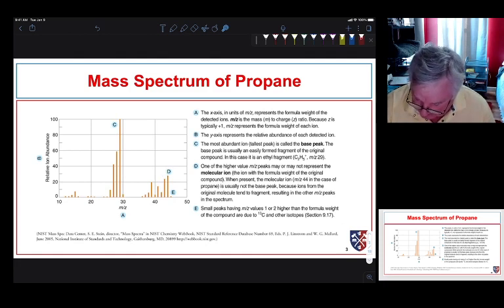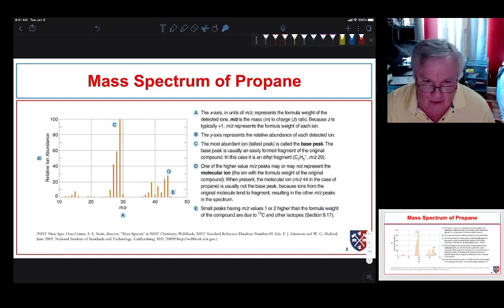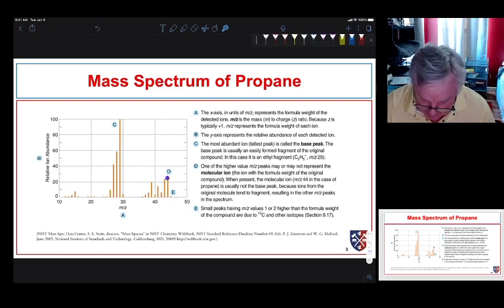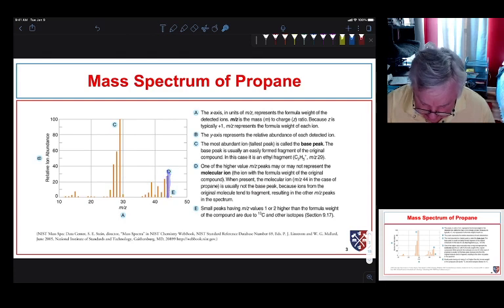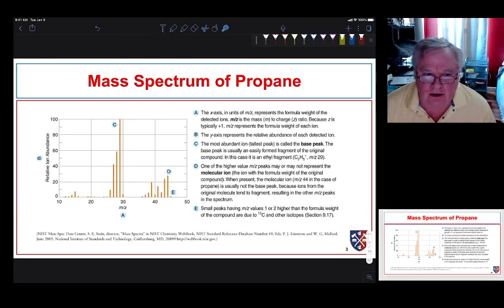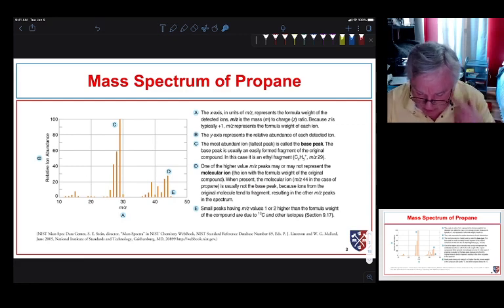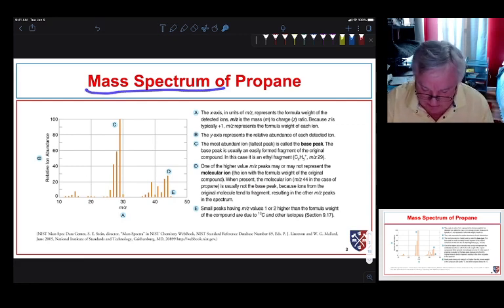Small peaks that are one or two mass units higher than the molecular mass of our sample are due to isotopes. This base peak corresponds to the propane radical cation, and there's a little peak at one mass unit higher because some molecules will have carbon-13 in them — one percent of all carbon is carbon-13, and most carbon is carbon-12.